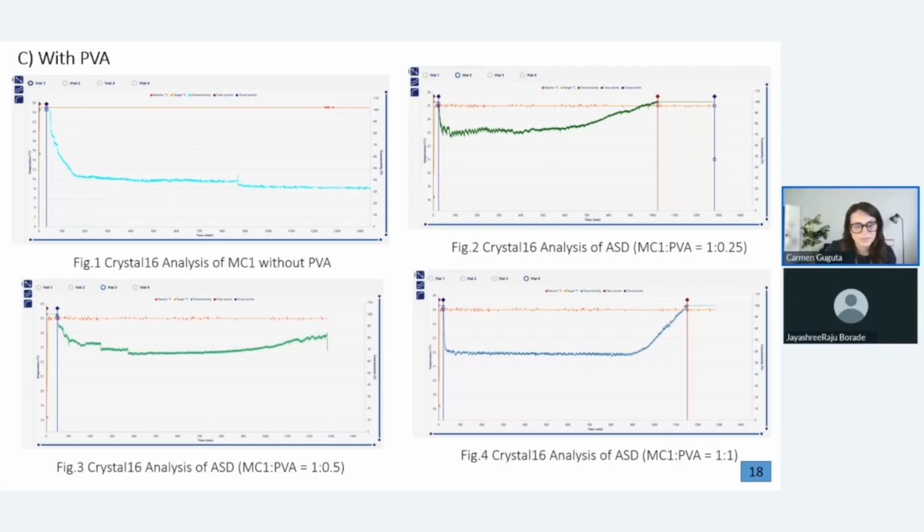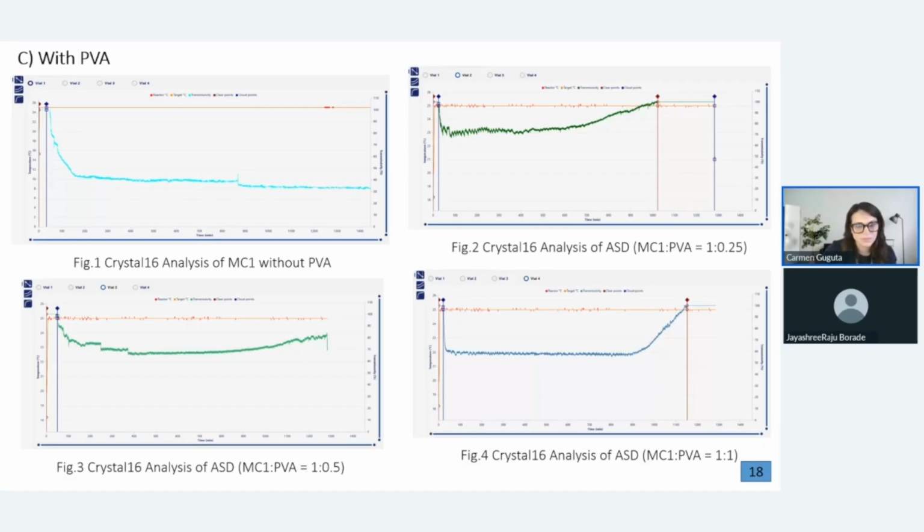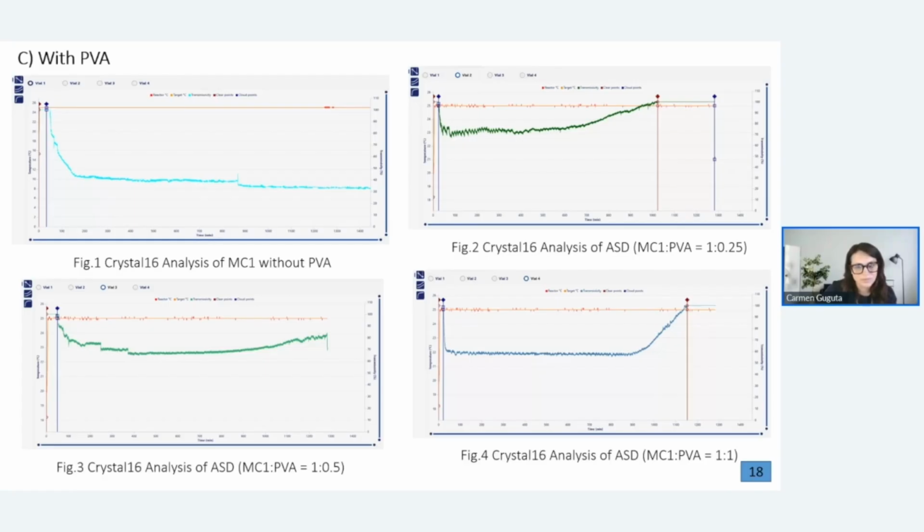We are making a stock solution of the API, which can be made with a larger quantity of the API if it's a handling issue, and then diluted according to the concentration that we need. Measuring the minimal quantity of the API in solid form for each vial is not required, so it might become easier to do the experiment.